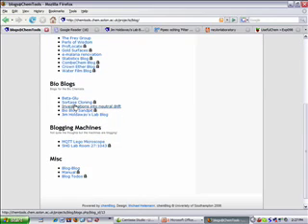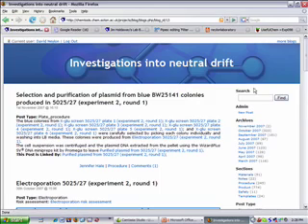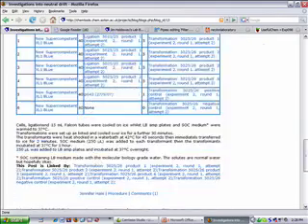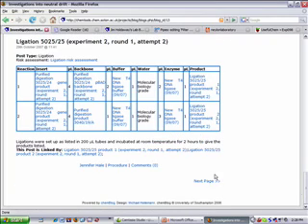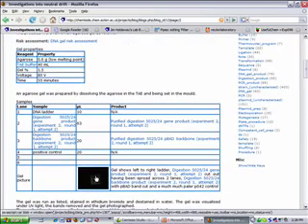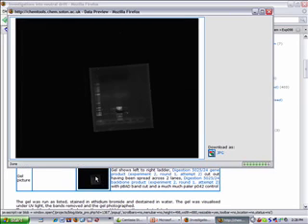So if I go back to Jenny's lab book, I'll try to find you an example of a gel. Trouble is that she's now running through the system so fast she doesn't actually run the gels that often. I can show you some pictures. Oh, there you go. There's a gel image. That's the result of the analysis, a picture. It's not the physical object. That is a JPEG rather than perhaps a higher quality image too, which is another issue.